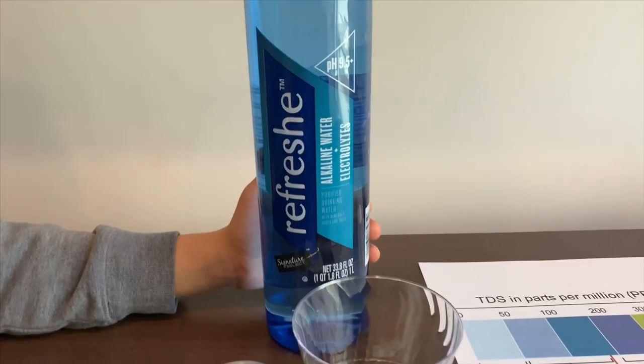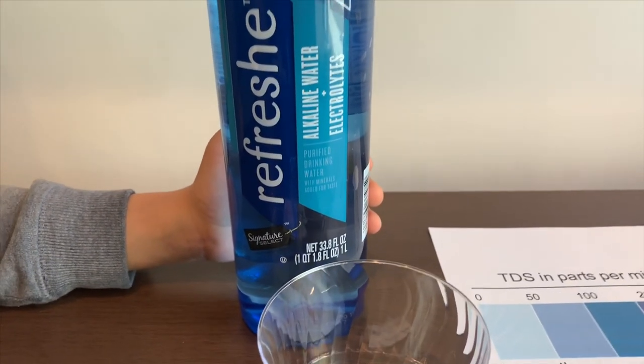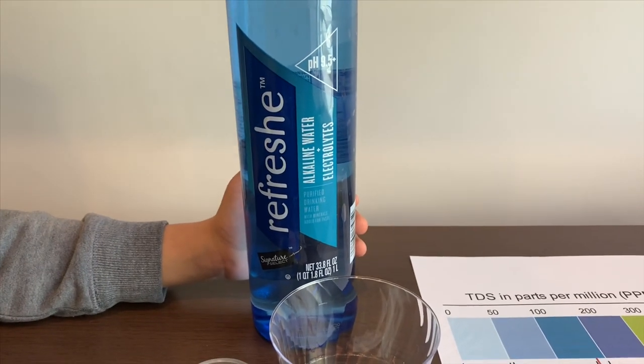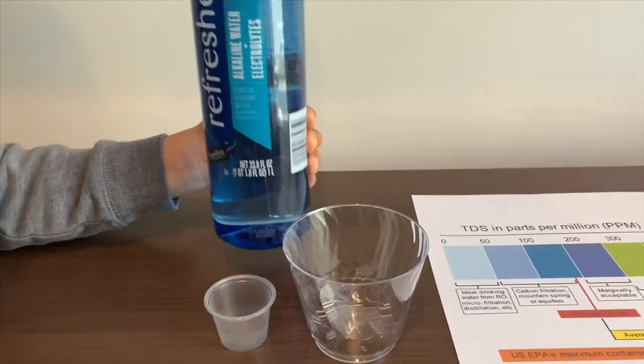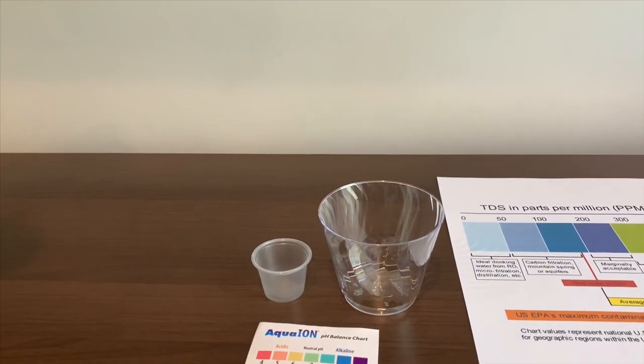This is a fresh purified alkaline water. It costs $1.49 and it's pH 9.5 or higher. Let's find out with our pH and TDS tester. Let's pour some water in.